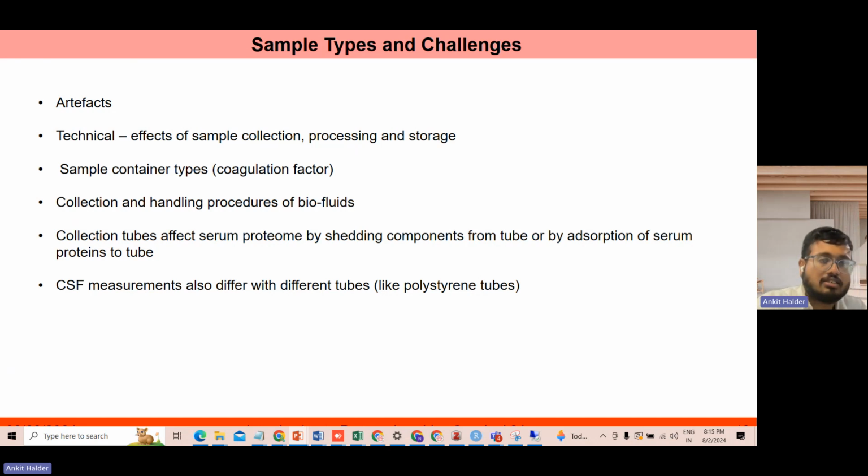There are many changes in your gel. In each and every gel you will be noticing them. Now that is due to biological variation or technical variation. That question you have to answer, and that confidence you have to bring in, that whatever changes you are observing between the two conditions and the cohorts of the two conditions, none of them are due to any technical reason but are due to one and only biological reason.